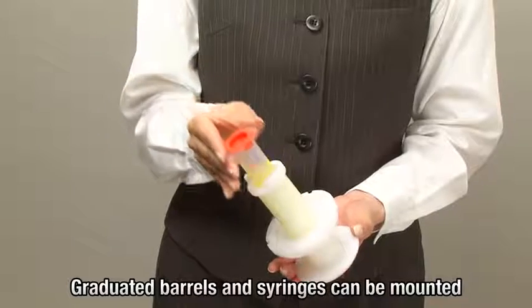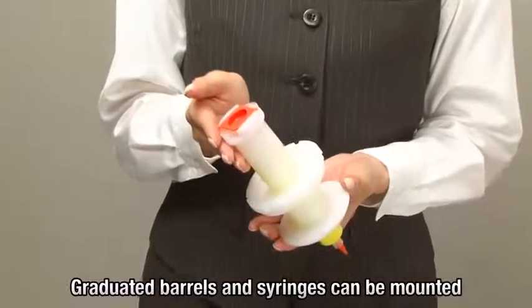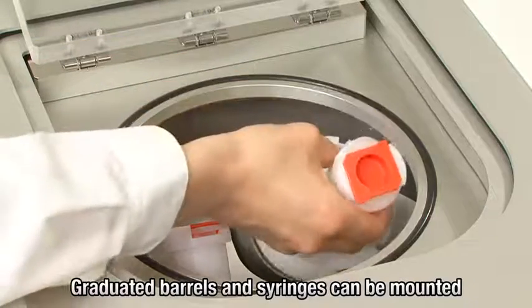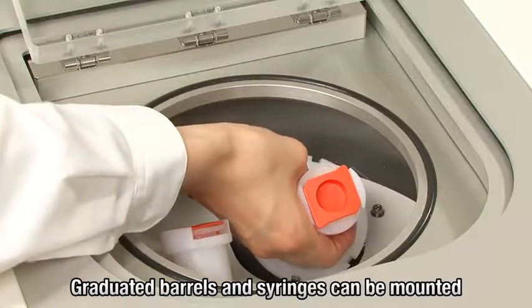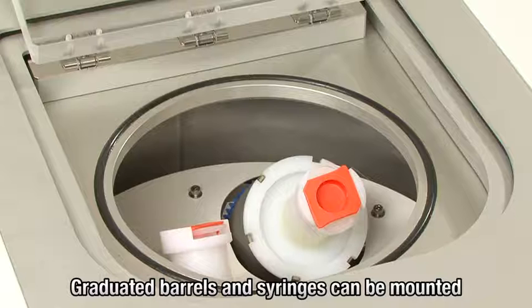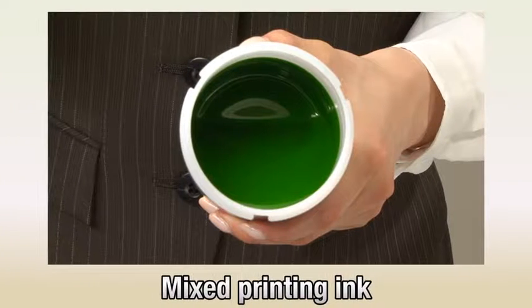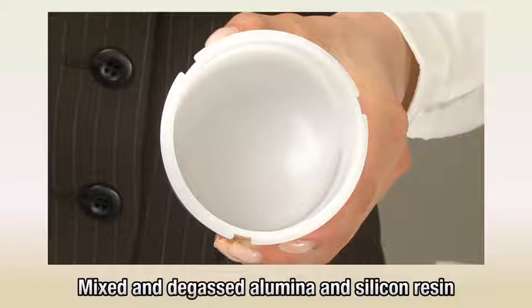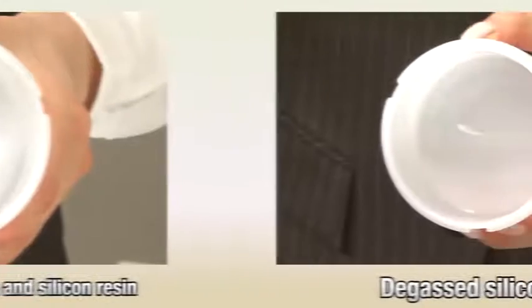Moreover, long barrels and syringes can be set in the holder and positioned at a fixed distance from the revolution axis for even mixing. It is possible to set the processing method for mixing and degassing various materials.